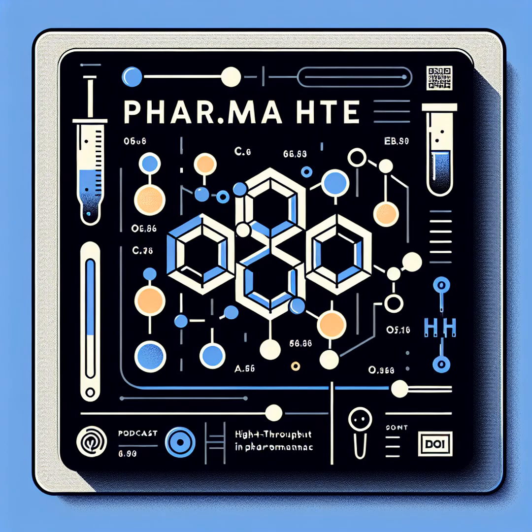This gave them a broad picture of the current landscape, but the researchers didn't stop there. They also went deep into 6 detailed case studies illustrating how various companies have successfully implemented HTE in their workflows. These weren't theoretical exercises. They showcased real-world examples of HTE in action. Automated liquid and solid handling, sophisticated robotic systems, and cutting-edge analytical techniques. The case studies provided valuable insight into the practical application of HTE.